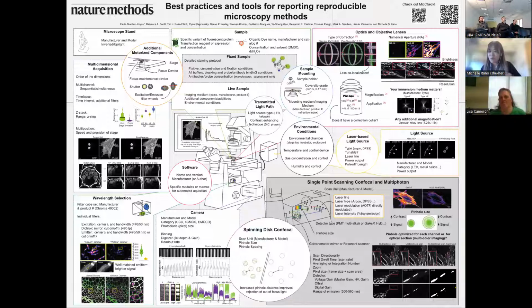So if you don't know them, you might actually get a different result than if you did a different setting. And so we hope that this helps you all to understand your hardware better and more fully, and that as you're setting up your experiment, you think about some of those controls and where you may be getting either the ability to more focus on the structure you're interested in, or time point or precision with more clarity, because you understand how that light is going through each of the different decisions you're making during acquisition.